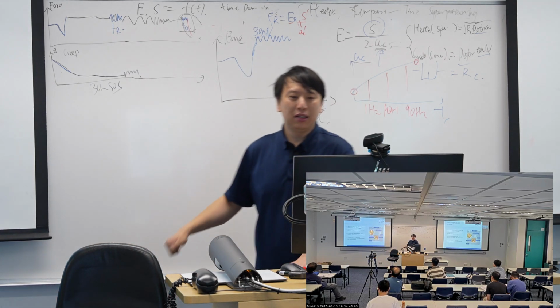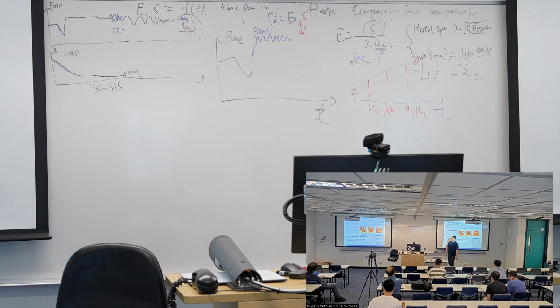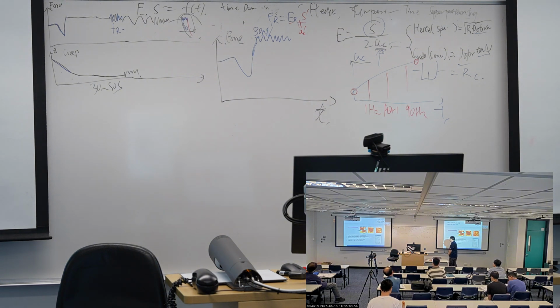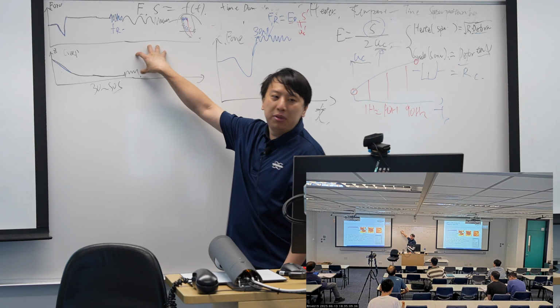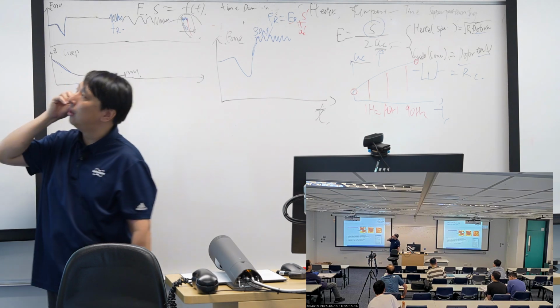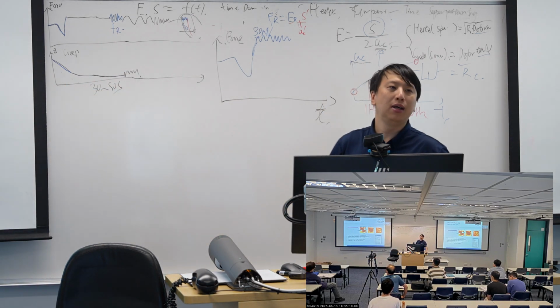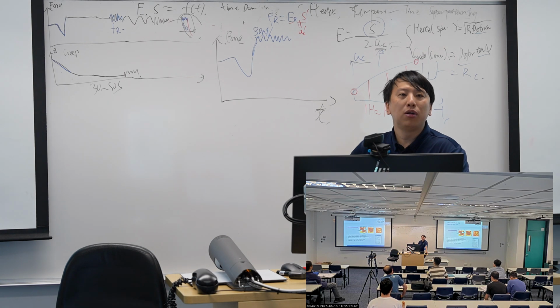Okay, that's about the nanoDMA. So the key idea is we use dynamic ways to do the force curve, and we introduce a modulation with the ramp and hold mode, and we introduce the ramp scripting to generate the spectroscopy. We use the force volume to generate the viscoelasticity mapping. And finally, we can get the viscoelasticity properties.